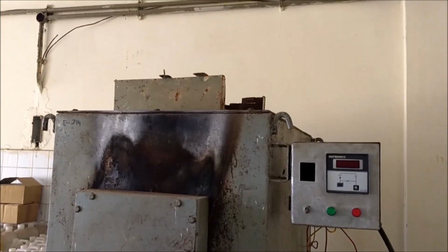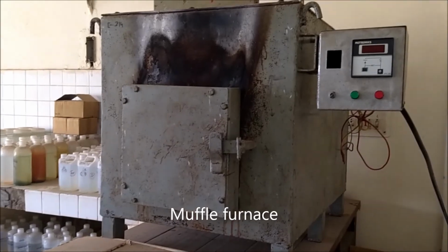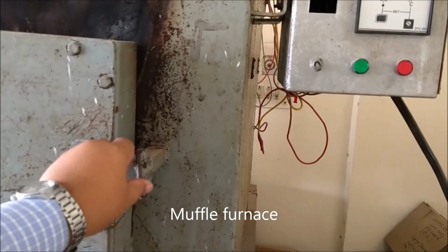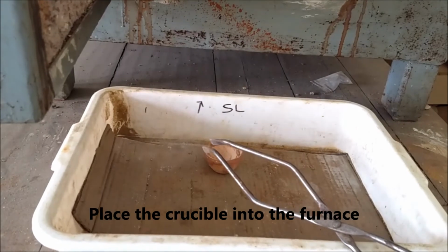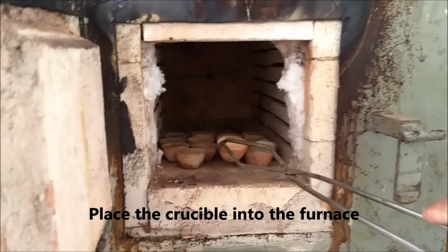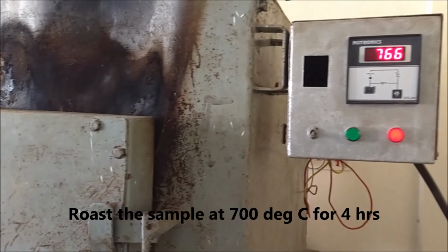After weighing, the crucibles are taken near the muffle furnace. Then we are going to place the crucibles inside the muffle furnace in this fashion. Then the samples will be roasted at 700 degrees Celsius for 4 hours.